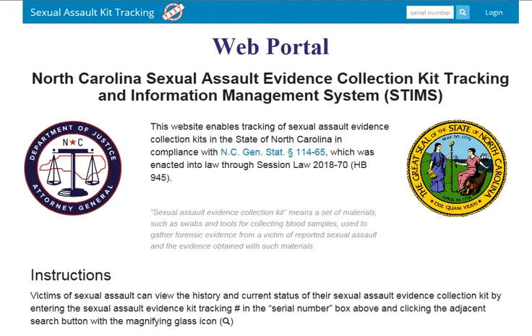Hi, and welcome to the training video for laboratory users using STIMS, North Carolina's Sexual Assault Evidence Collection Kit Tracking and Information Management System. In this video, I will demonstrate how evidence personnel will receive sexual assault kits into the laboratory system and return them to submitting or requesting agencies. Also, what data fields need to be entered by analysts for laboratory results.